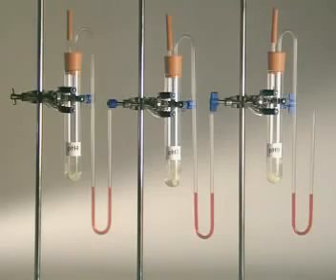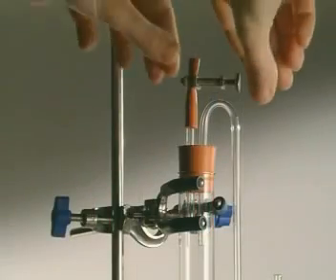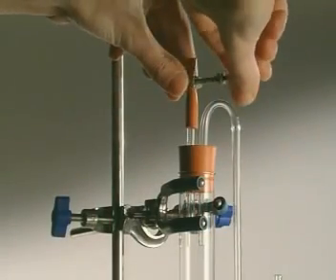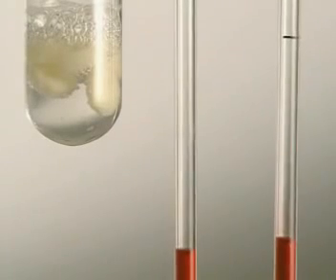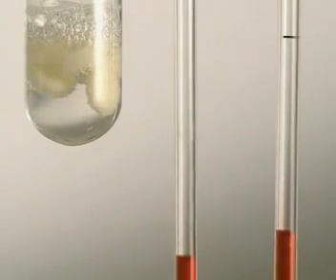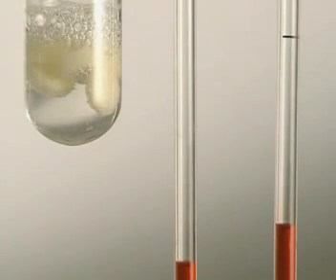A simple manometer is attached to each tube. As the system is sealed, the oxygen produced pushes against the manometer fluid and causes it to rise up the right-hand side.